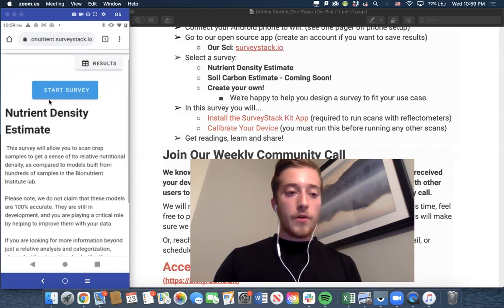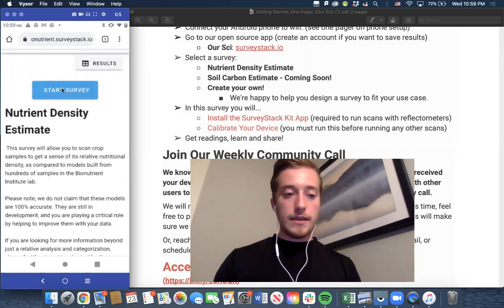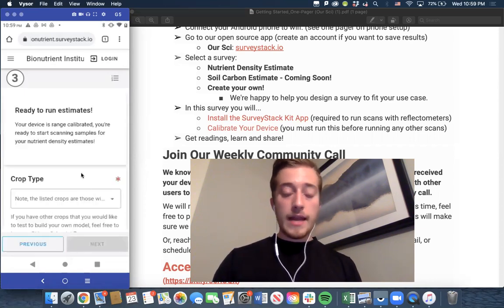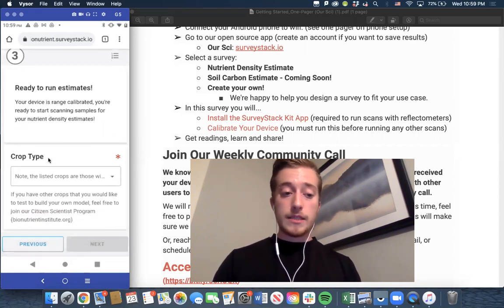So I'm going to once again start my nutrient density estimate survey in bionutrient.surveystack.io. If you're an RSci user, use surveystack.io as is shown in this one pager. I do not need to calibrate my instrument. I just calibrated it, so I'm going to click next. And it brings us to the same page that would pop up at the end of a calibration. So I'm ready to run my estimates, and I can choose my crop type.